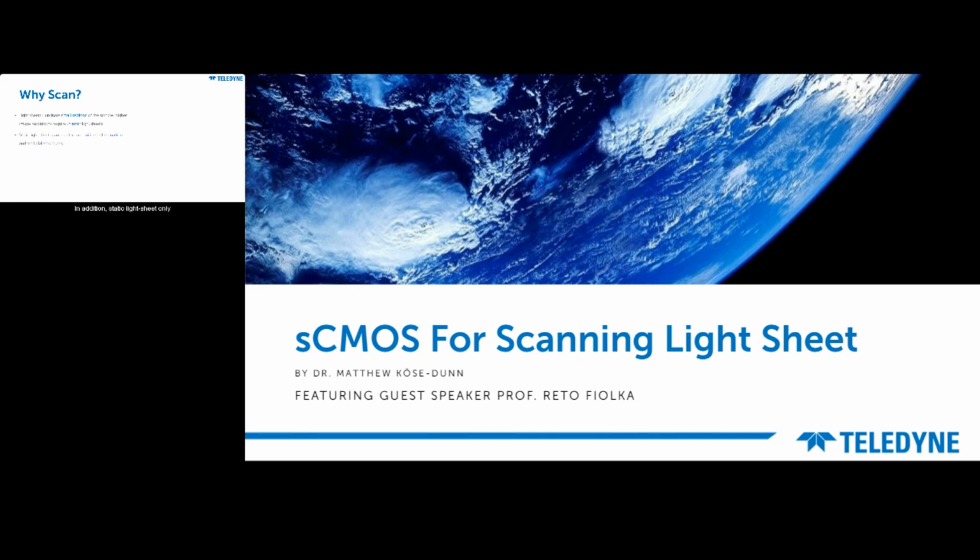In addition, a static light sheet only illuminates the sample in one direction if using one light sheet, for example, from left to right. And this can cause shadows and artifacts due to this non-uniform illumination. This issue can be resolved by rotating the sample itself or by using multiple illumination objectives, so using multiple light sheets from multiple directions. But this can lead to longer exposure times and increased photo damage, as well as potentially reducing sample geometry options if your sample has to be rotated.